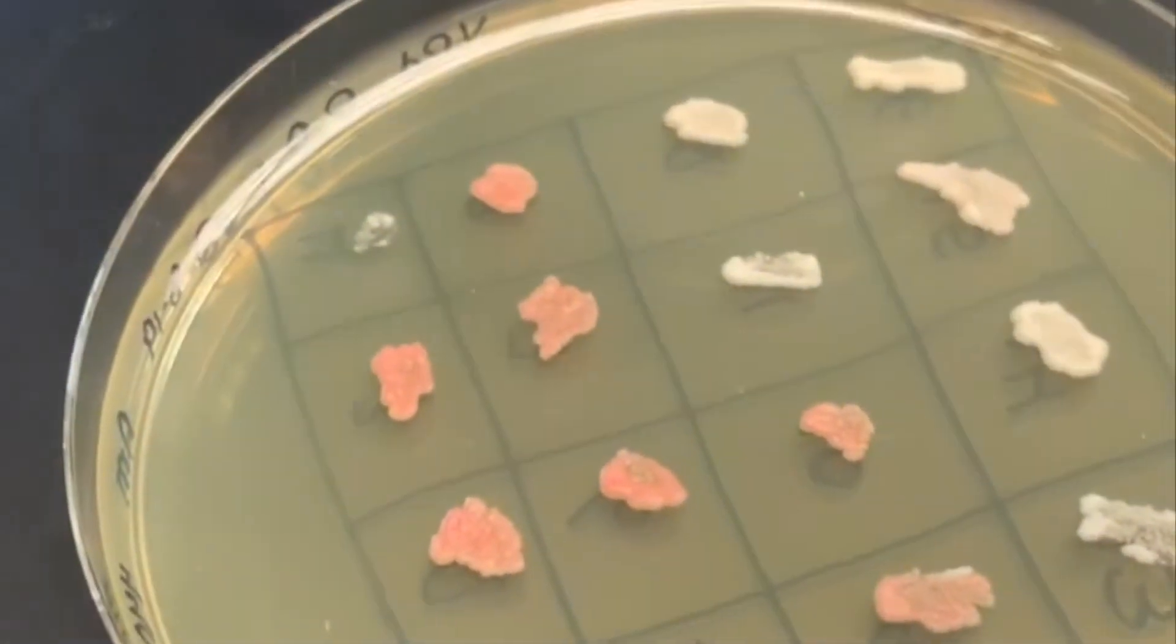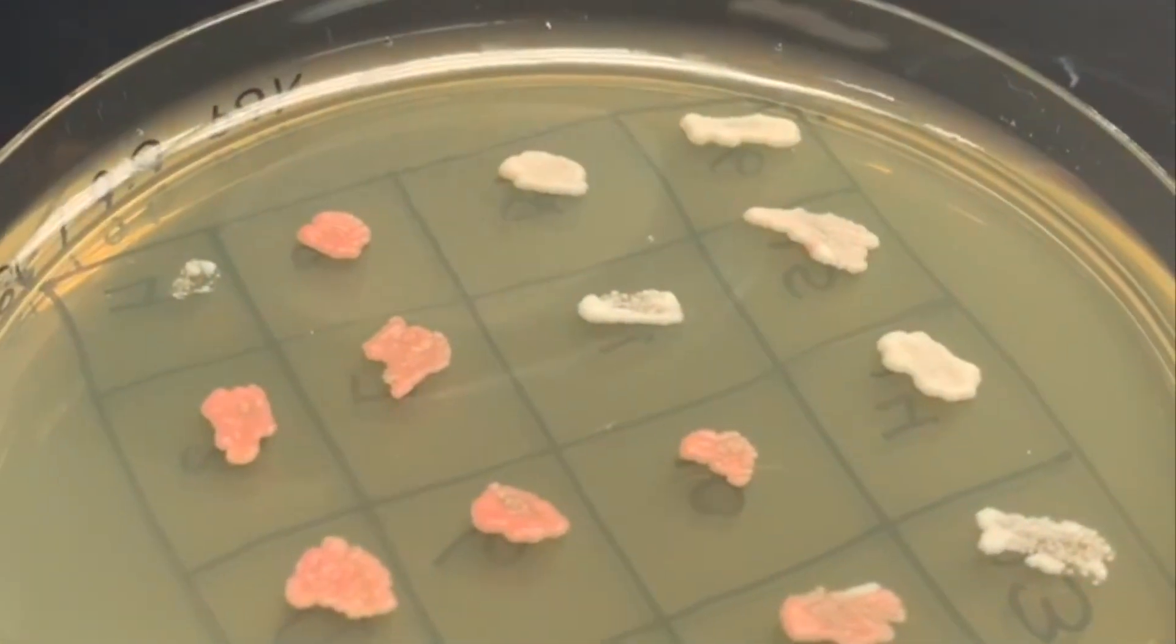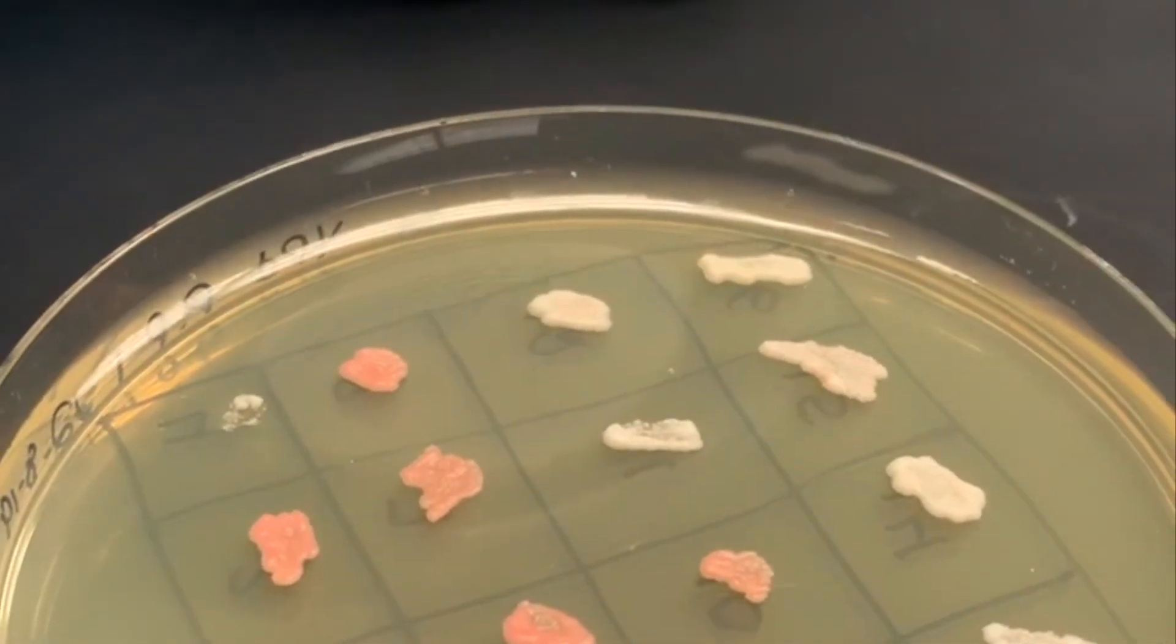To extract this plasmid for further use, a technique called smash and grab is used to isolate all genetic material present in the yeast, including our plasmid product.